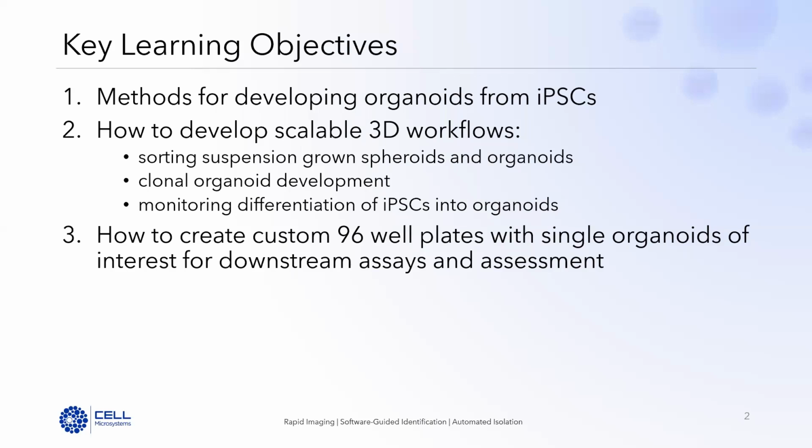You're currently working with these, or you are thinking about implementing iPSC-derived organoids into your research programs. Today, by the end of the presentation, you will have taken away, hopefully, some valuable information for these workflows, including methods for developing organoids from iPSCs, how to develop scalable 3D workflows, whether you're sorting suspension-grown spheroids or organoids, if you're interested in clonal organoid development, and monitoring differentiation of iPSCs into organoids.